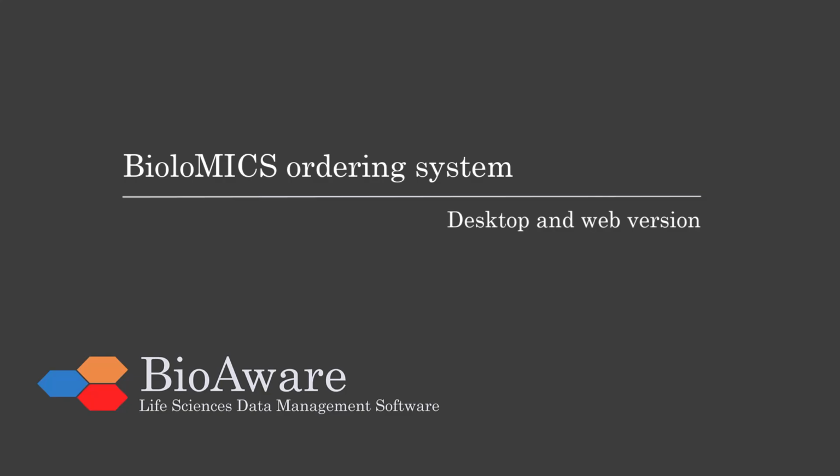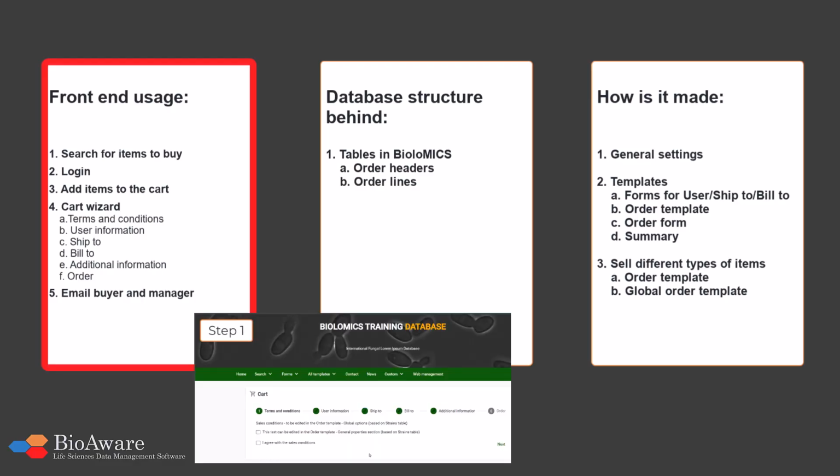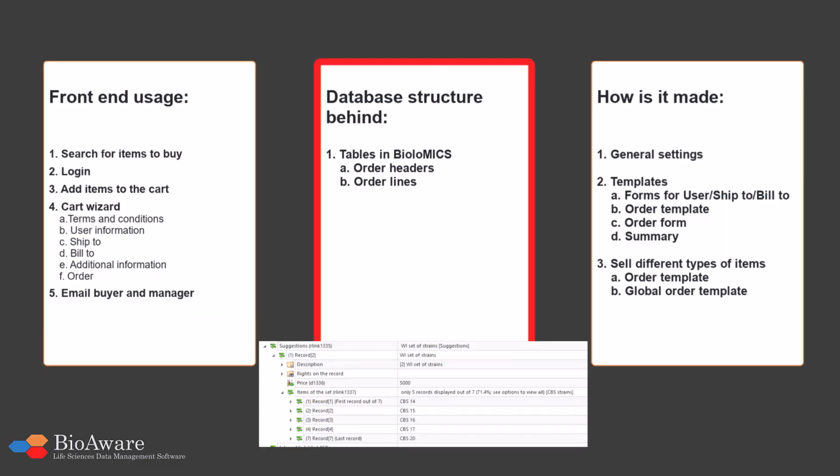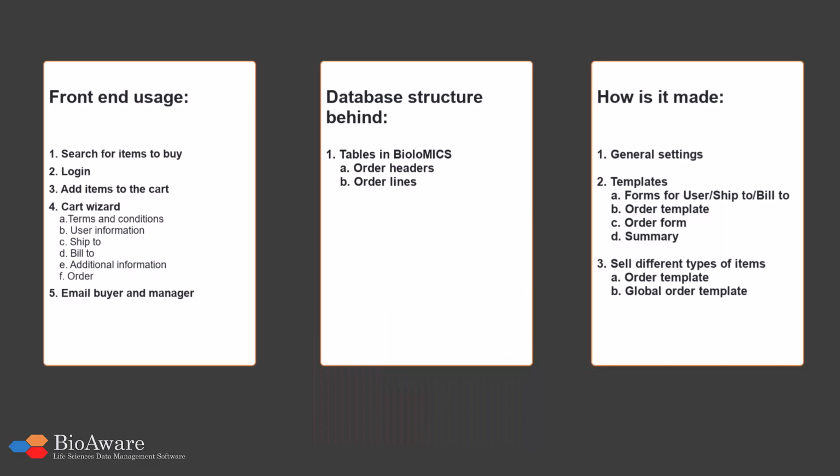Hello and welcome. In this movie we will show you the ordering process on a BioloMICS-based website. The movie can be split into three sections. The front-end usage, any registered user can use that. The database structure, which is in BioloMICS, and how it is made for the administrators.